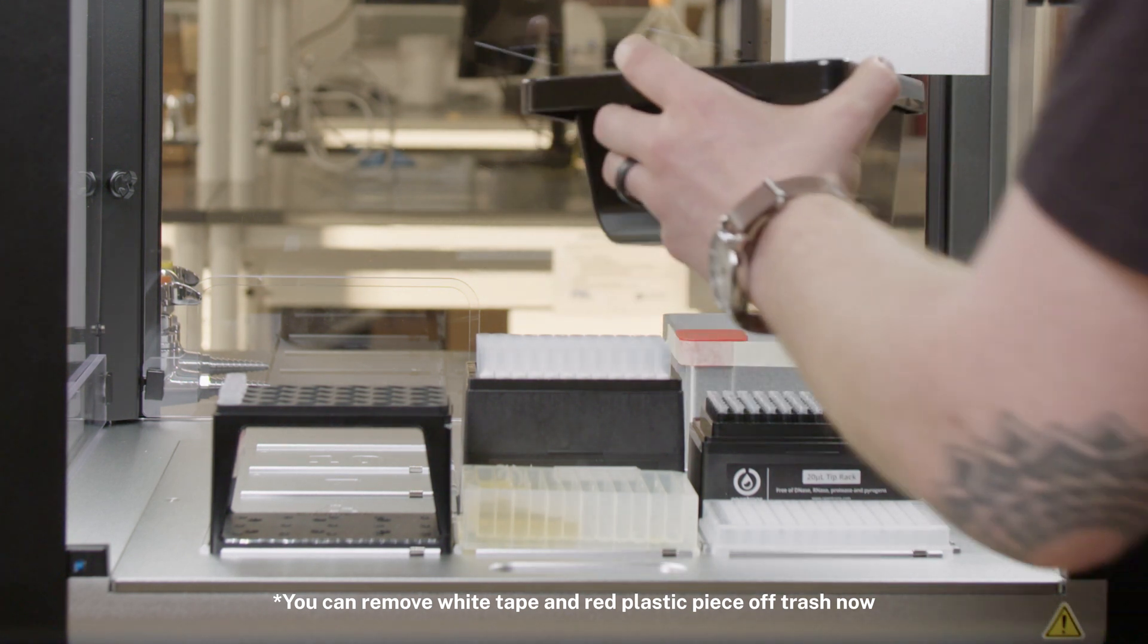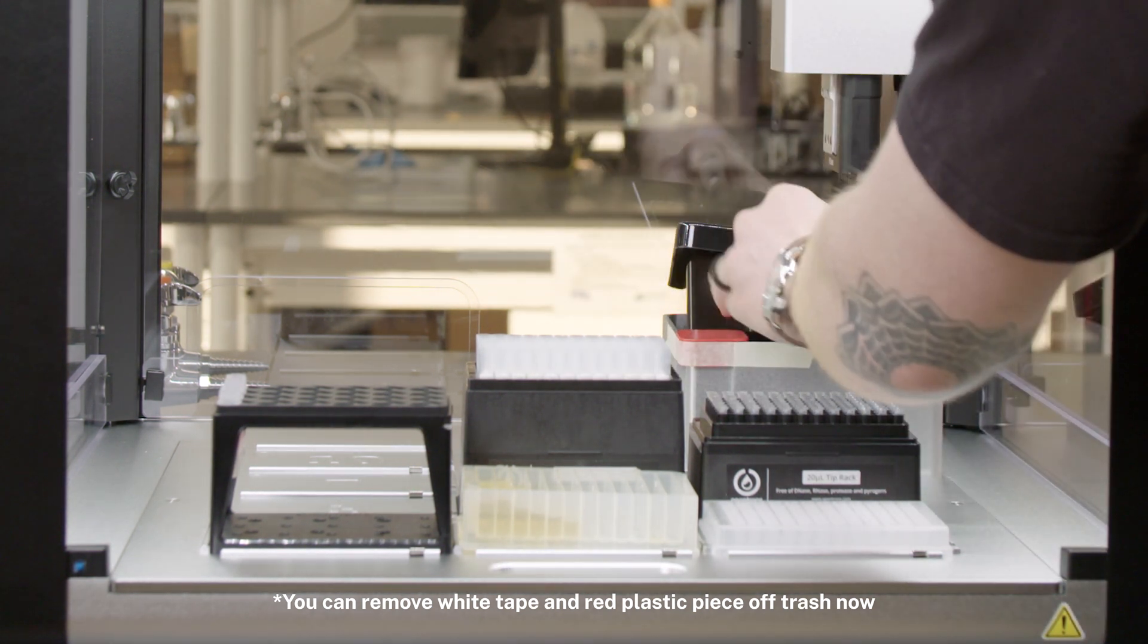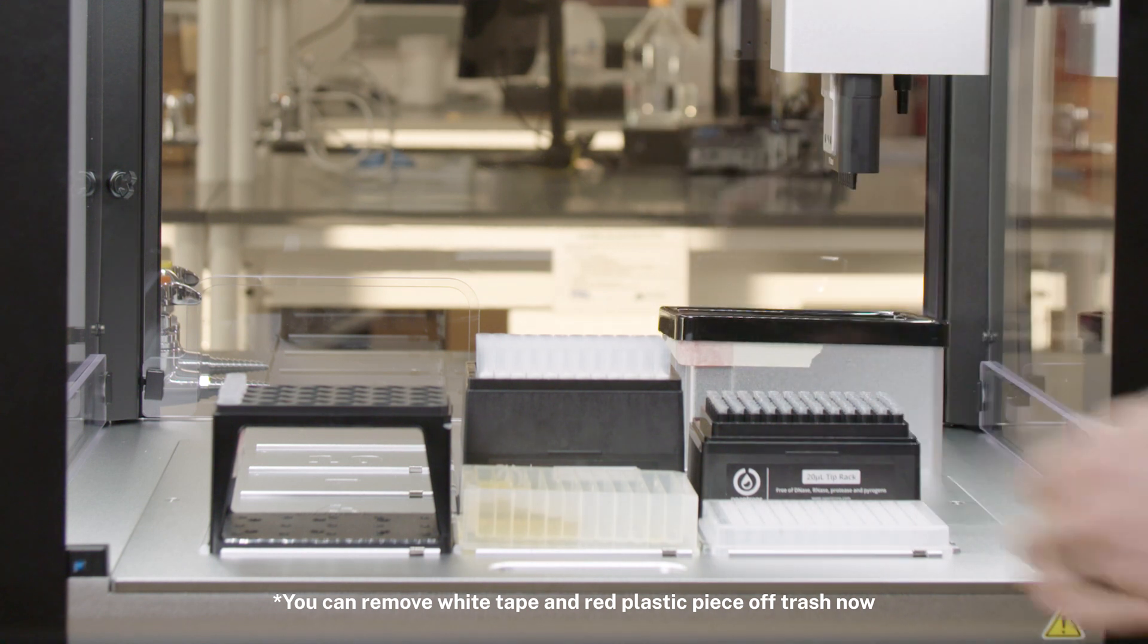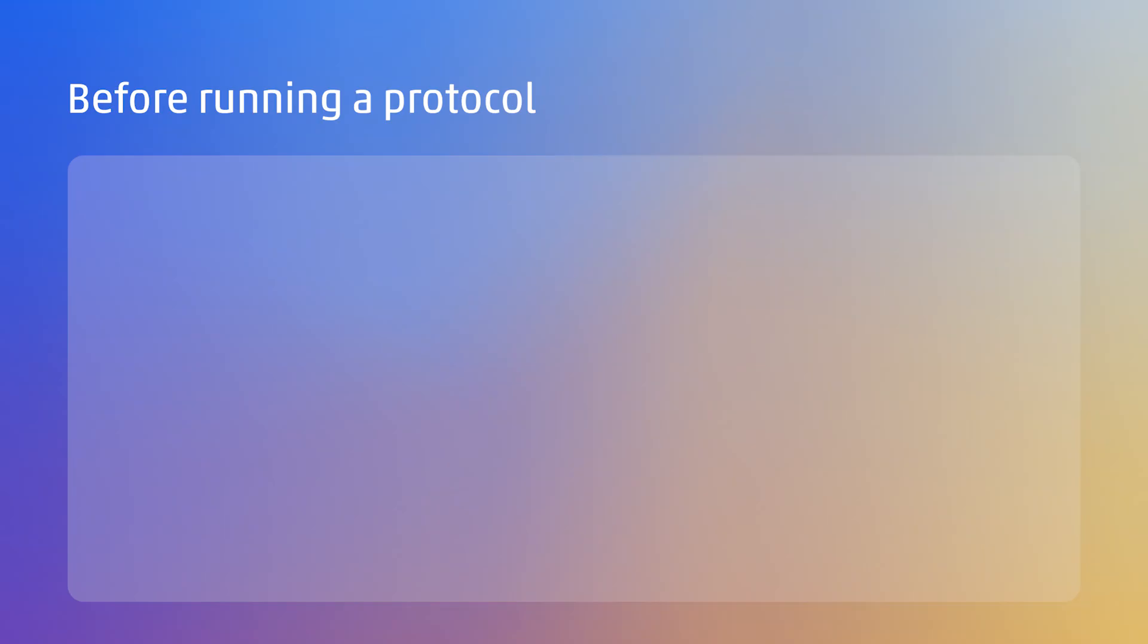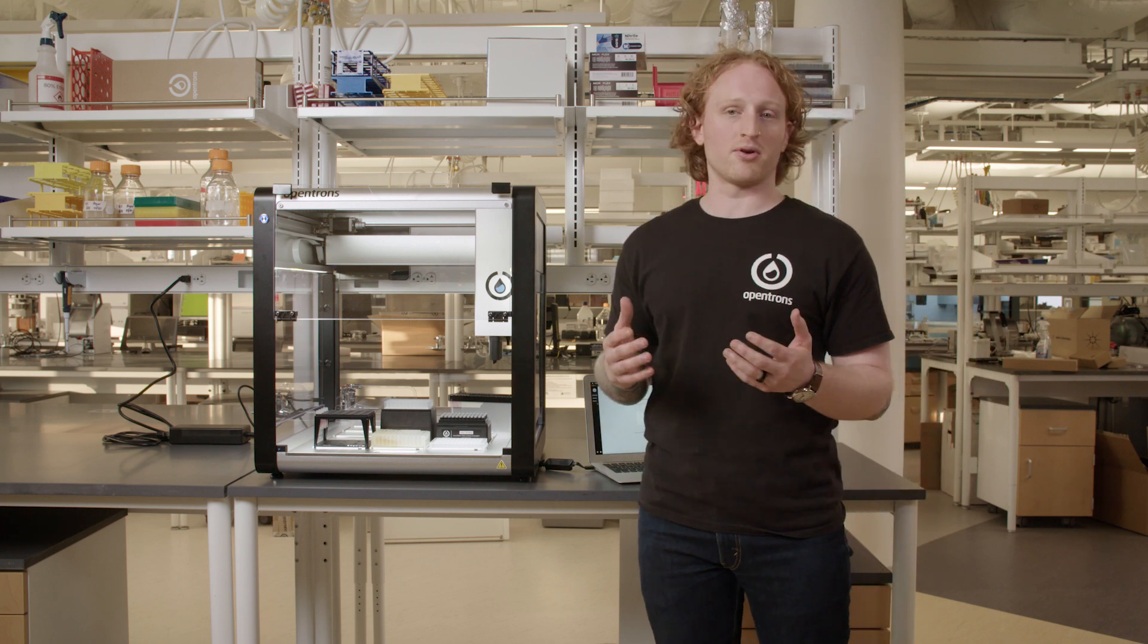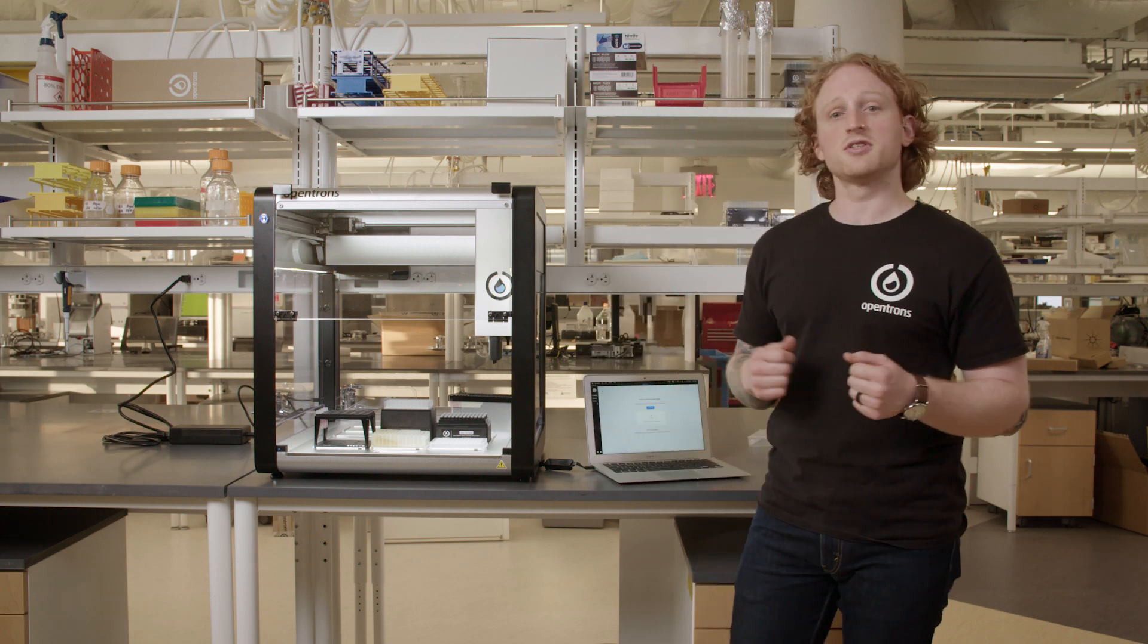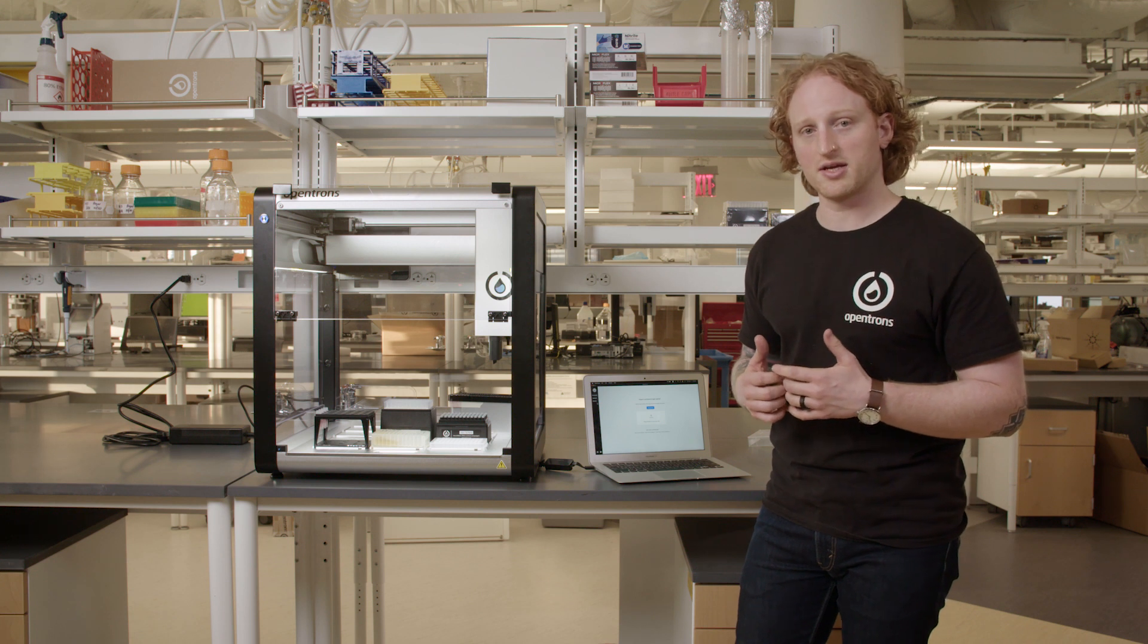This trash will protect the metal from anything that's disposed of in your tips. To run a protocol on the OT2, I will need to have my pipettes attached and have gone through the deck, tip length, and pipette offset calibration. To begin, I will need a protocol. I have one I created for these videos using our Python API.